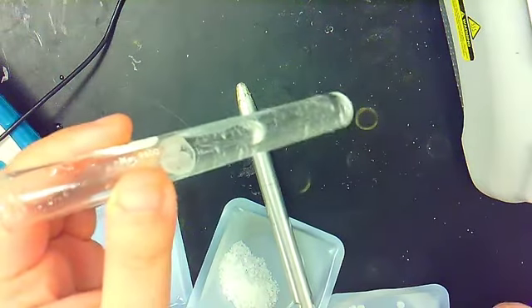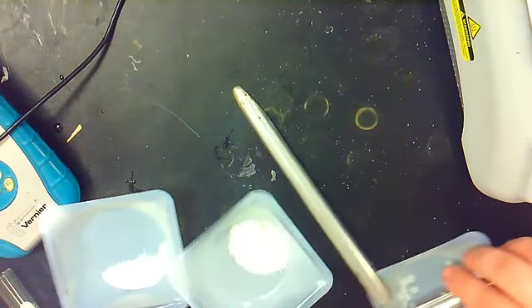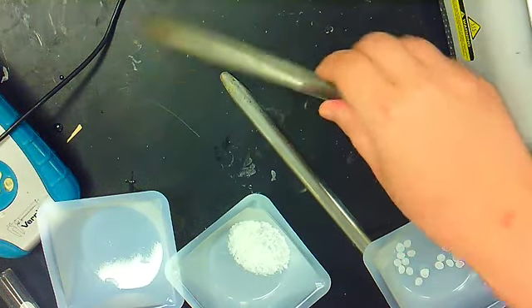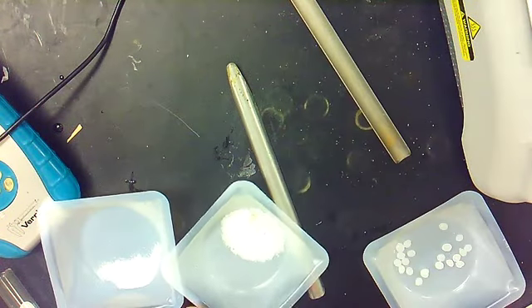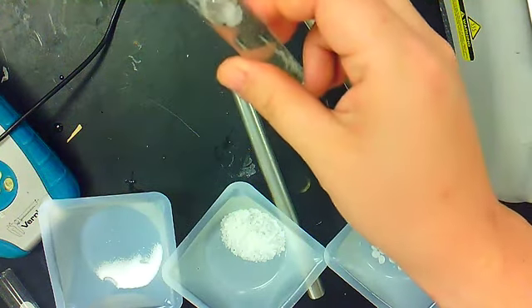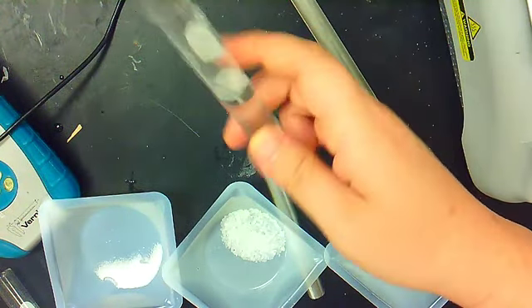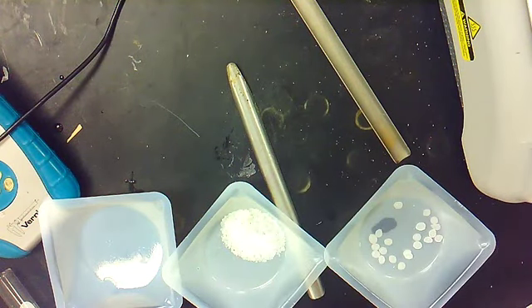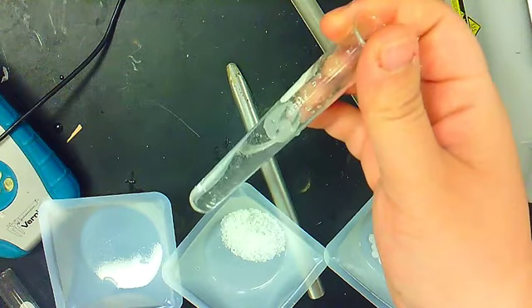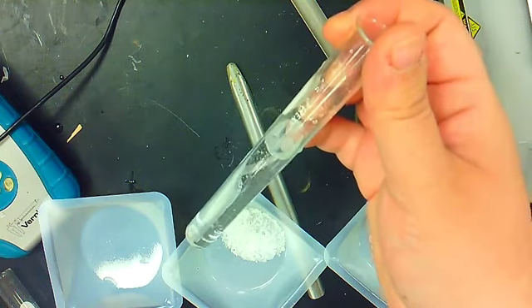Okay, so there they are. I'm just shaking them. Okay, and nothing is happening. Okay, even though they're larger, once I can see that there's going to be no change, I can move on. Okay, so there are still those 3 little pebbles on the top. All right.